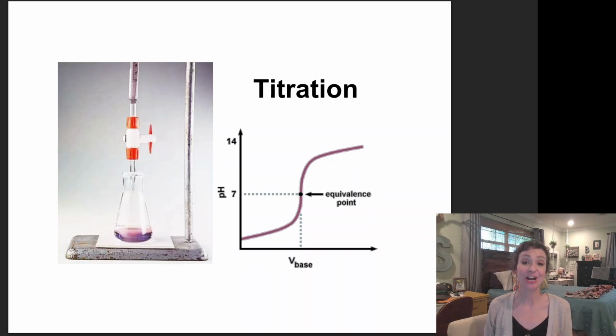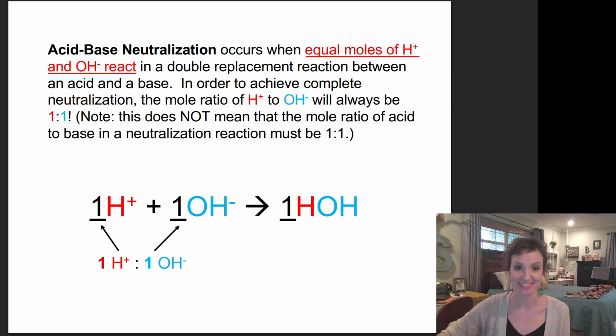In this lesson, we're going to talk about the procedure of titration and how that can be useful for us to figure out something unknown about acids and bases. Okay, let's throw back to our last lesson on acid-base neutralization.